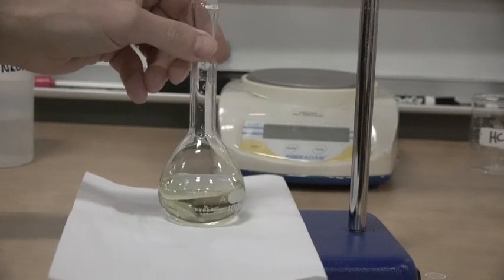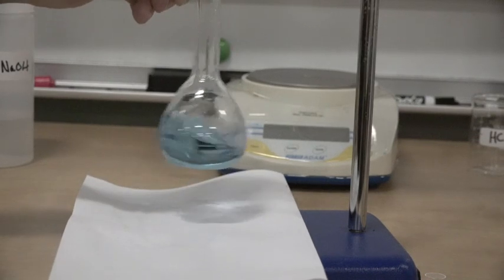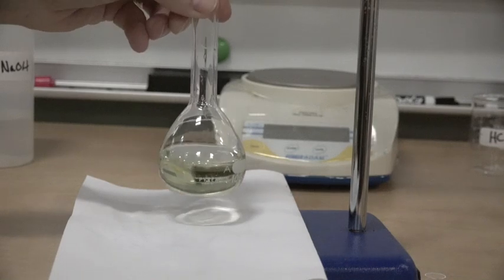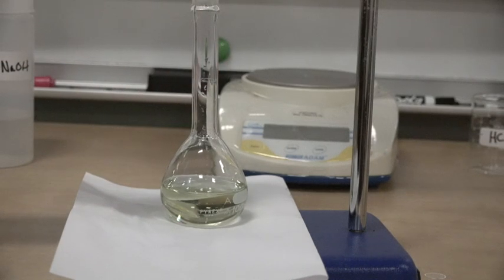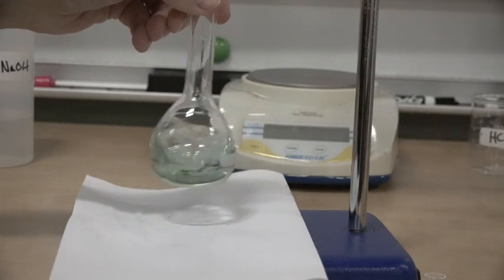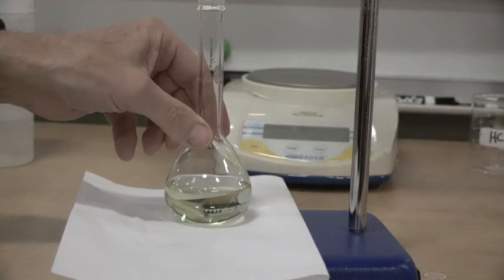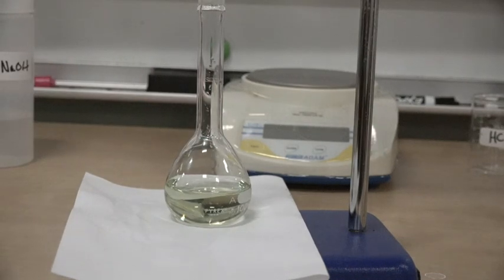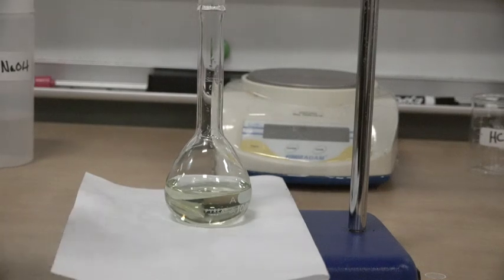Oh, it's just about there. Maybe a couple more drops and we're good. That should do it. So that is green right now. Now watch what happens if I put too much base in it. So that's neutral. So what I'm going to do is read the burette.